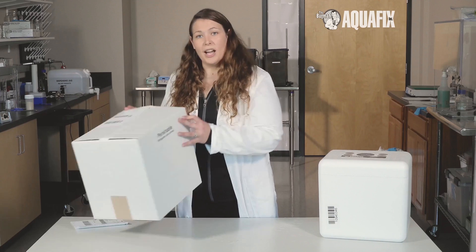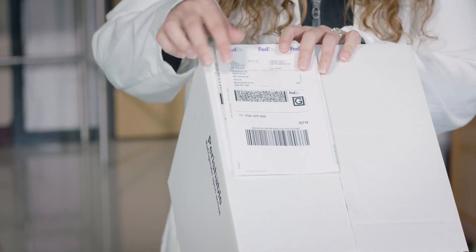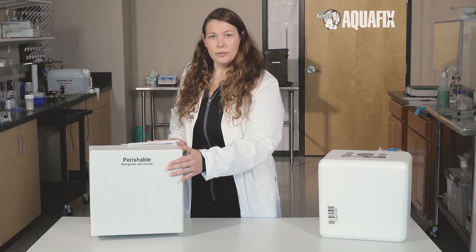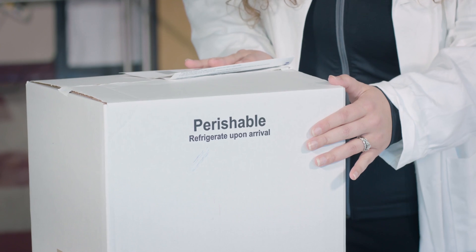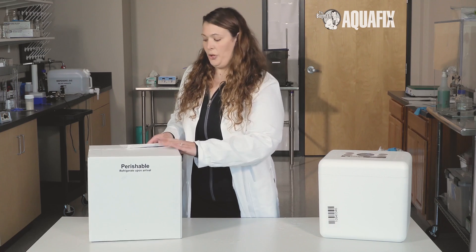If sending your sample back in the box provided, it is important to remove or cover the label completely. The note on the side of the box — perishable, refrigerate upon arrival — is for the return trip. There is nothing perishable in the kit that we send to you.